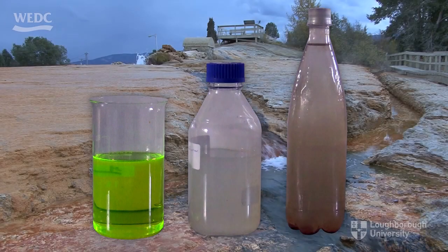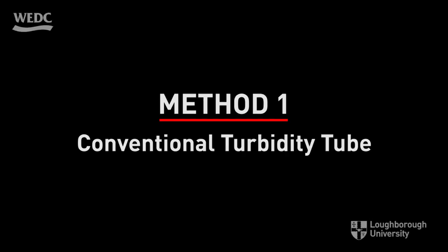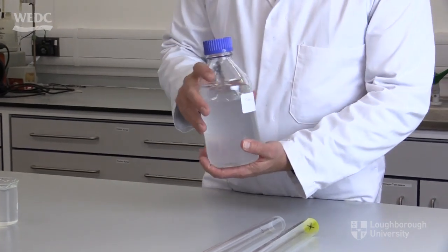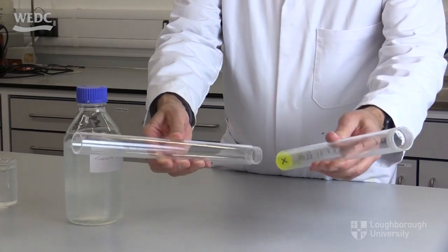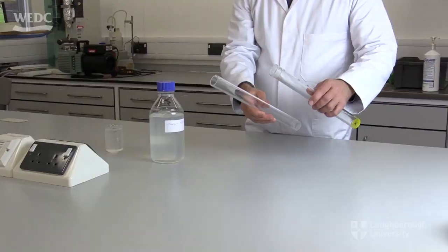This may help us to decide how to treat the water, but it does not tell us how turbid the water is. We turn now to the three methods of measuring turbidity. We have some fairly dirty water here, but we don't know how dirty or turbid it actually is. We'll look at the first means of measuring turbidity using a conventional turbidity tube.